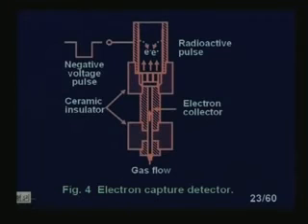Now, the particular radioactive sources which are used are tritium adsorbed in titanium or scandium, and nickel 63 as a foil or plated on the interior of the cathode chamber. So your chromatograph will change. Obviously, if the chromatograph changes, efficiency, selectivity, everything will change. So this has to be precise, what are the desired values of the chromatogram that are to be maintained, right.